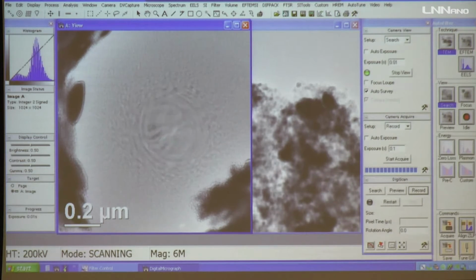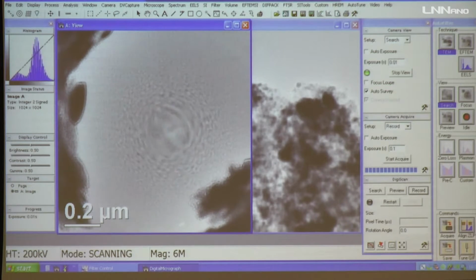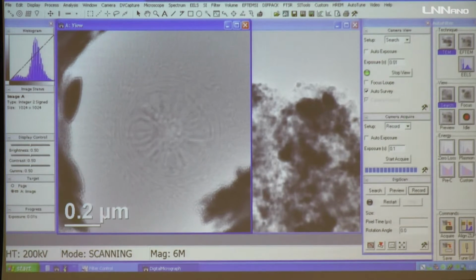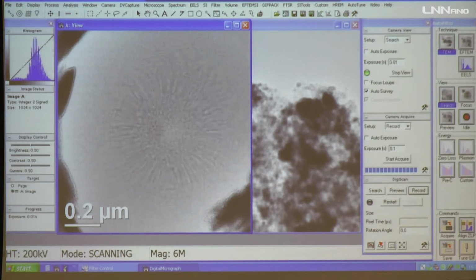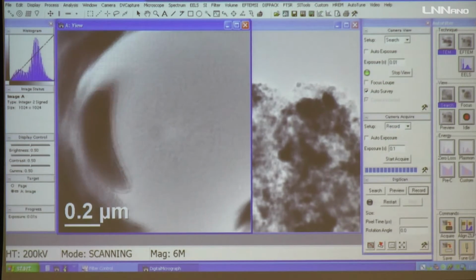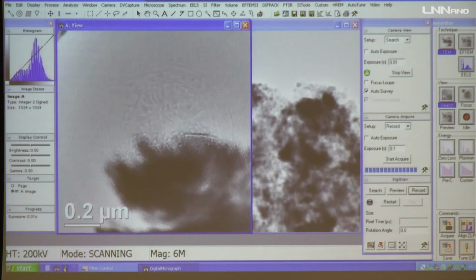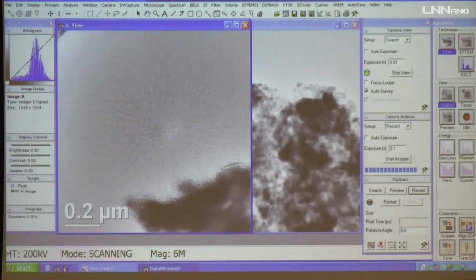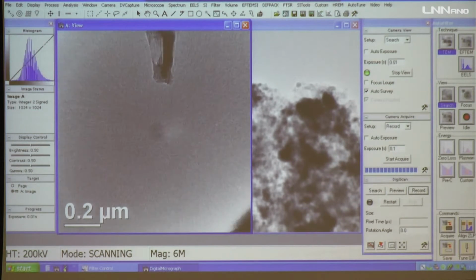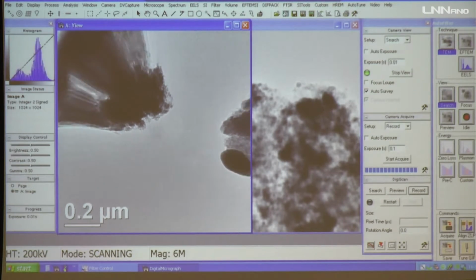You can see we can manage the size of the Ronchigram just by focusing, under-focusing or over-focusing, okay? Then if we go inside the Ronchigram, what we will get is the inverted image. This way here. I am by the side of this, and it simply appears on the other side of the screen. Okay?